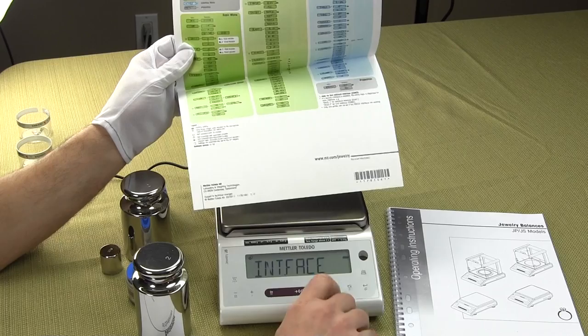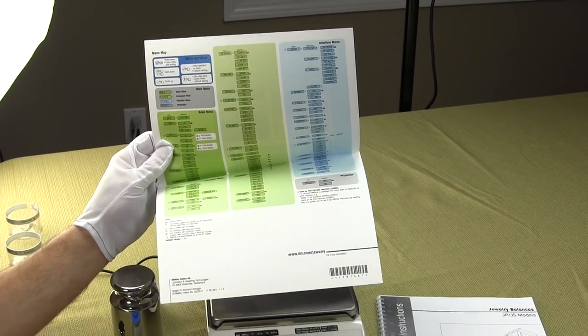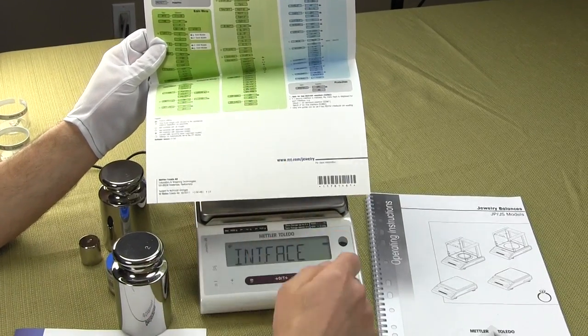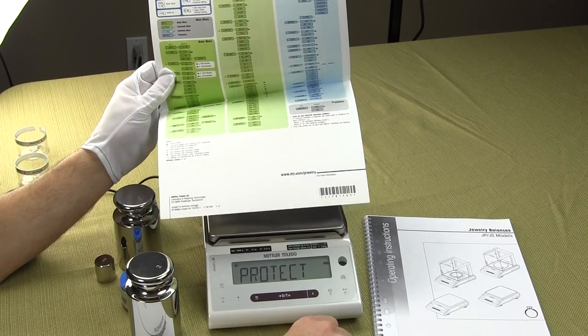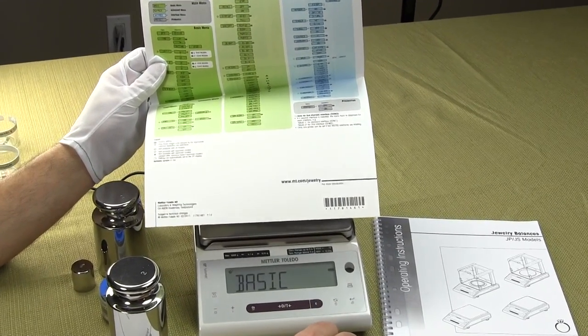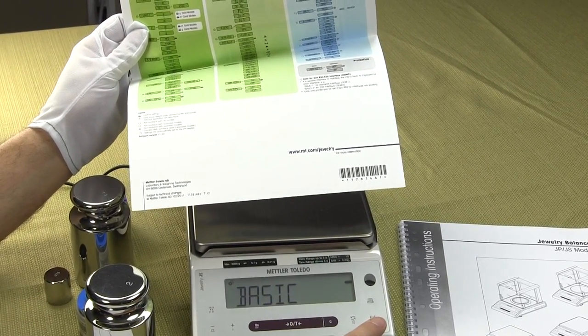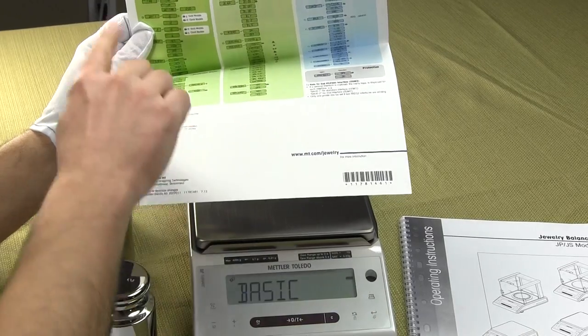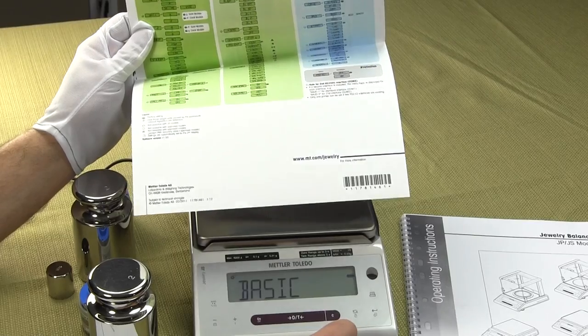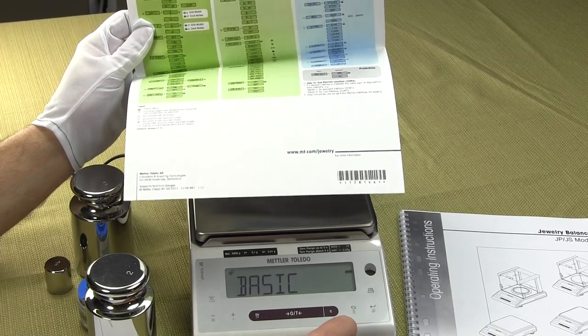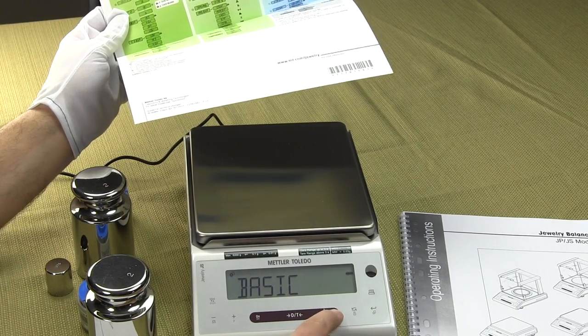So now we're in the menu for all the interface. This is in regards to the RS 232. Press it again. This is protective mode so you can lock it out so that nobody can use your balance. If I'm in the basic mode, this key brings you through the sub menus. There's almost 40 different menu settings altogether. So there's a ton of flexibility with this Mettler Toledo balance. And to get out of everything, you can just press the C.